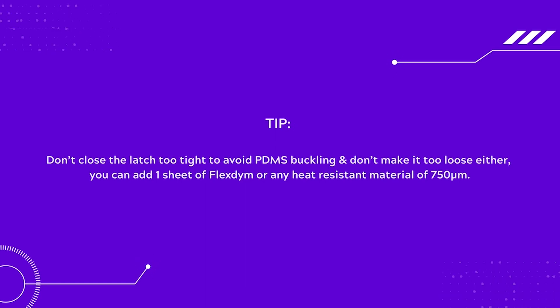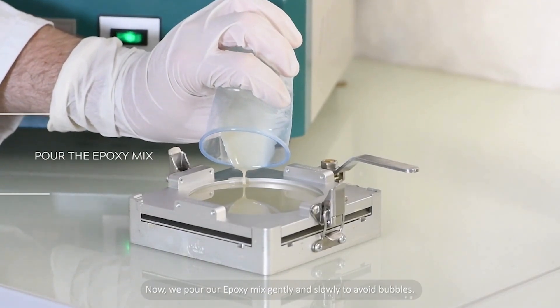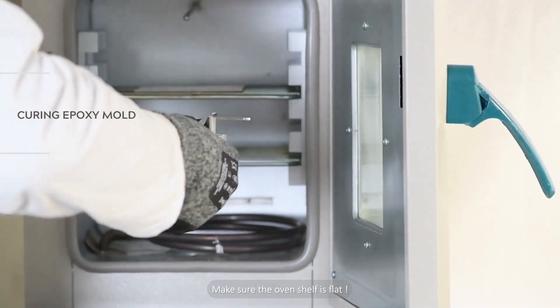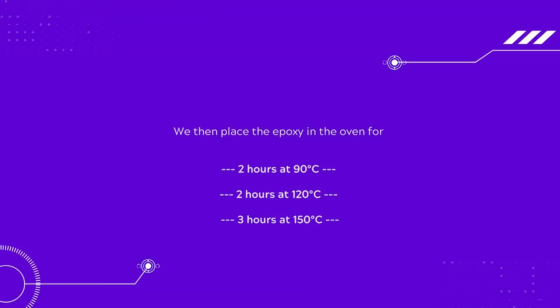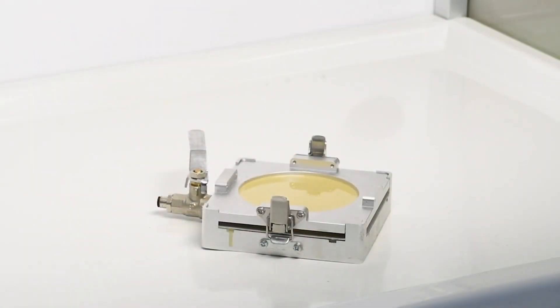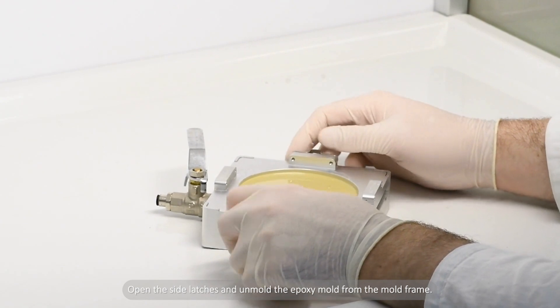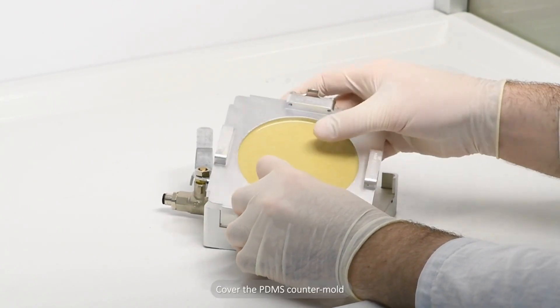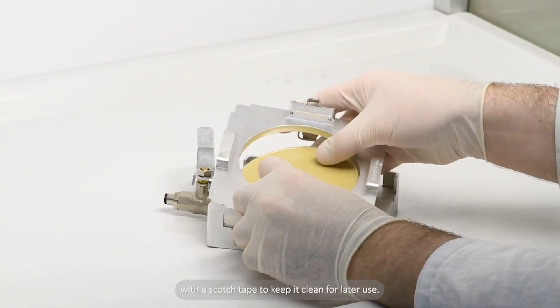You can add one sheet of Flex Dime or any heat resistant material of 750 micrometers. Now pour the epoxy mix gently and slowly to avoid bubbles. Make sure the oven shelf is flat. Place the epoxy in the oven for 2 hours at 90 degrees Celsius, then 2 hours at 120 degrees Celsius, then 3 hours at 150 degrees Celsius. Open the side latches and unmold the epoxy mold from the mold frame. Use IPA in case of difficulty in unmolding. Cover the PDMS counter mold with a scotch tape to keep it clean for later use.